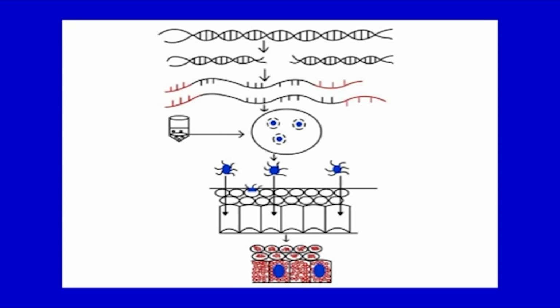The DNA on each of these beads is sequenced using a series of coupled enzymatic reactions, and these are collectively known as pyrosequencing. In pyrosequencing, a solution containing only one of the 4 dNTPs is flowed over the bead containing slide. Now, if that dNTP is complementary to the first unpaired base on a template strand, DNA polymerase catalyzes its addition to the primer strand and releases pyrophosphate ion.